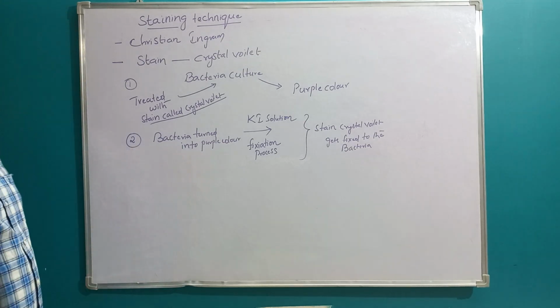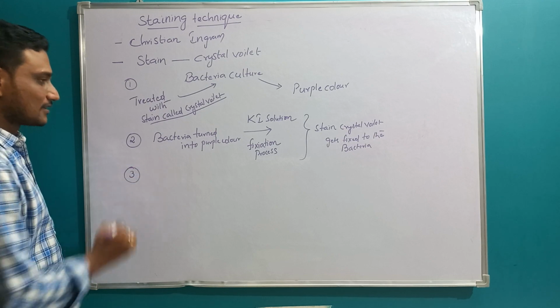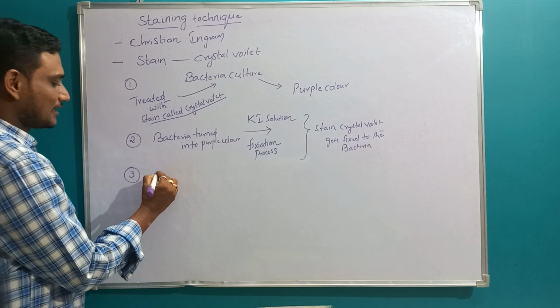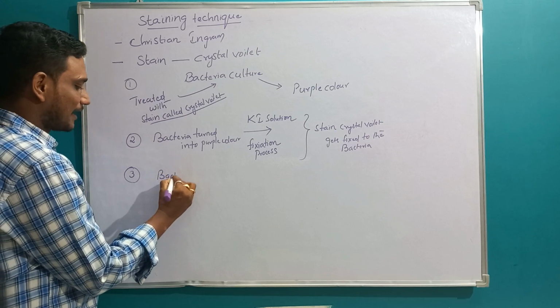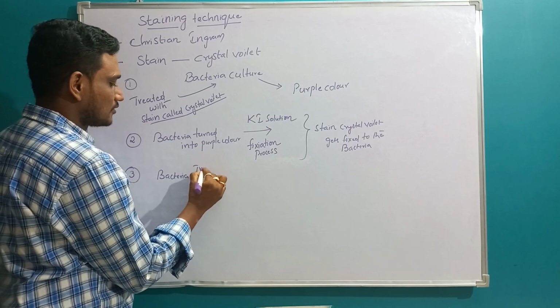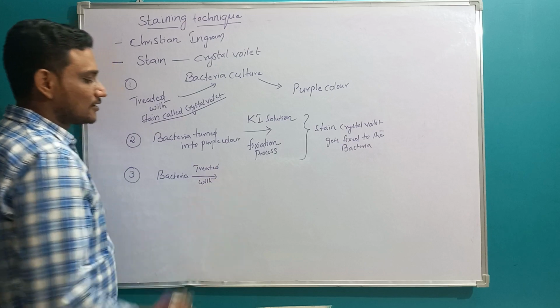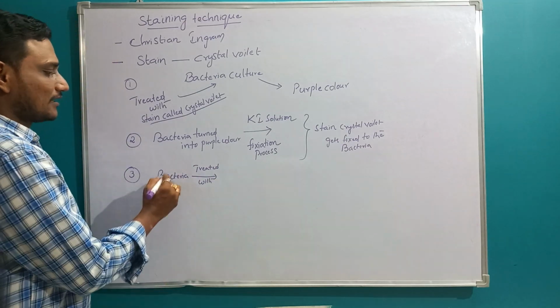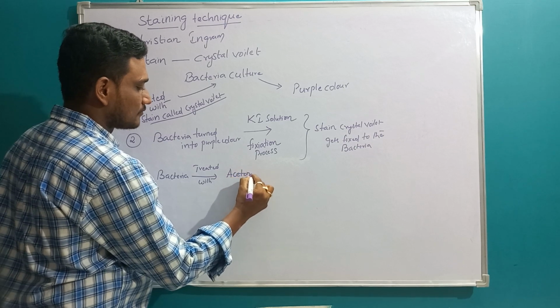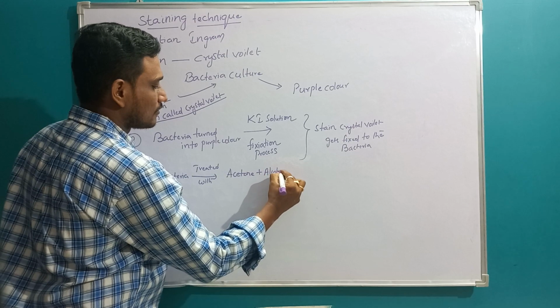After this, in the third step, after the fixation process, the bacteria are treated with acetone plus alcohol.